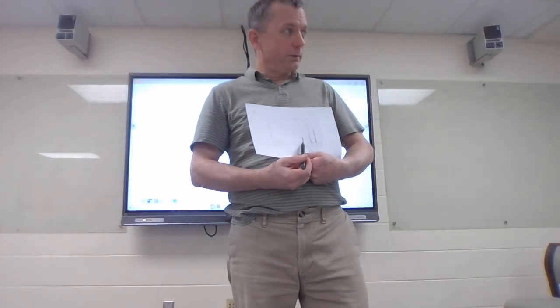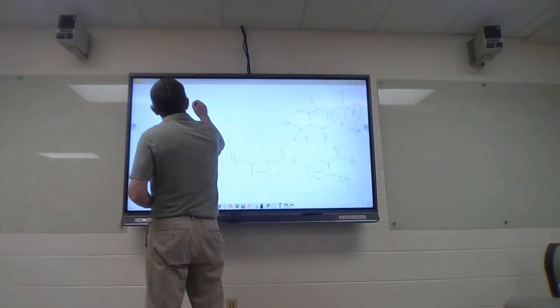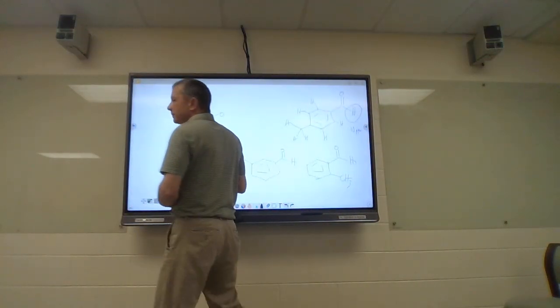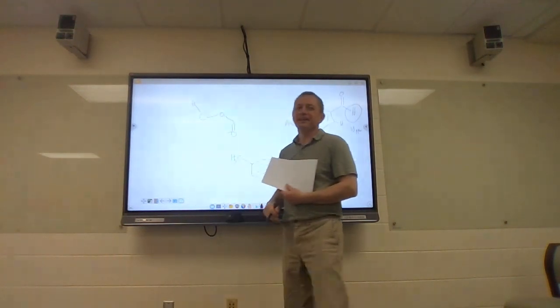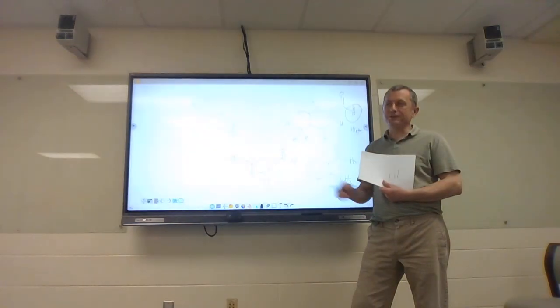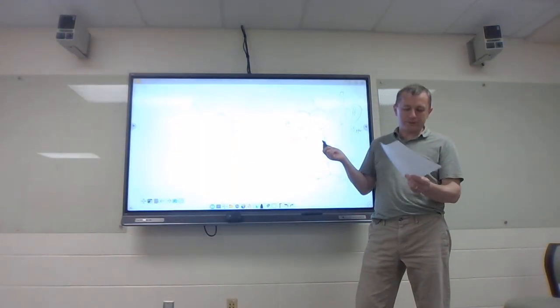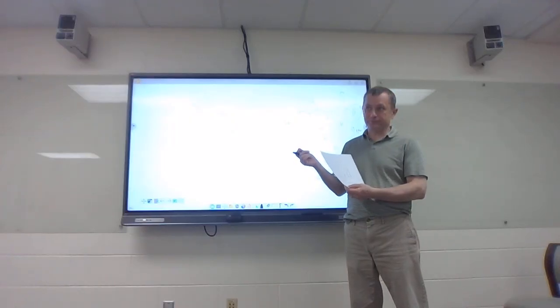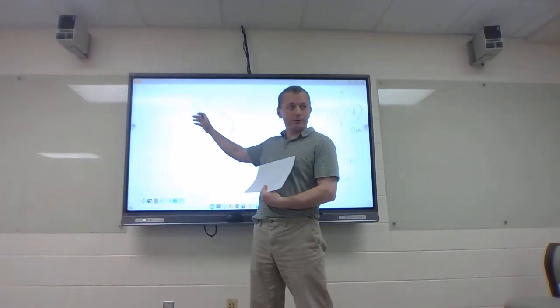Around 4. And so that's going to be hydrogens on a carbon next to an oxygen. That is typically an ester. So I'm just going to automatically guess I have an ester, in part because I have 2 oxygens. Only because those hydrogens are at 4.